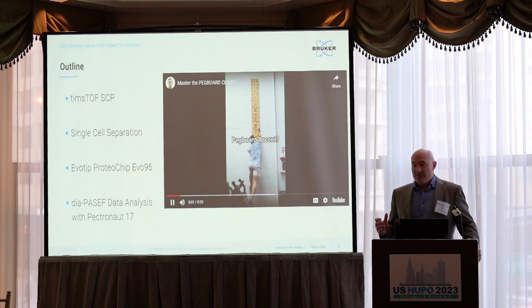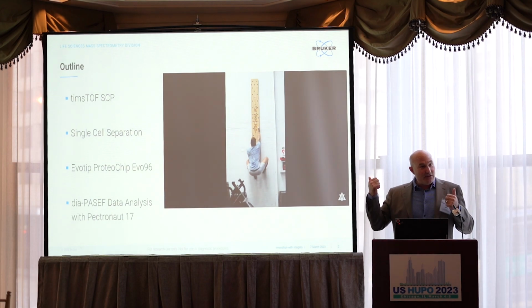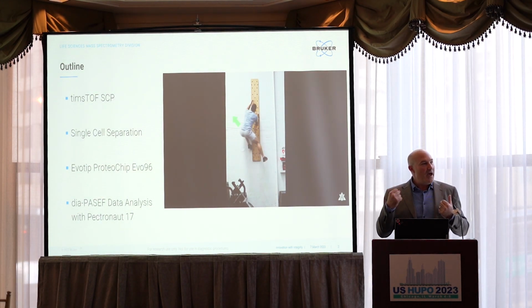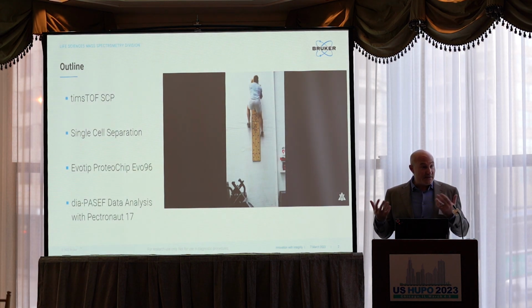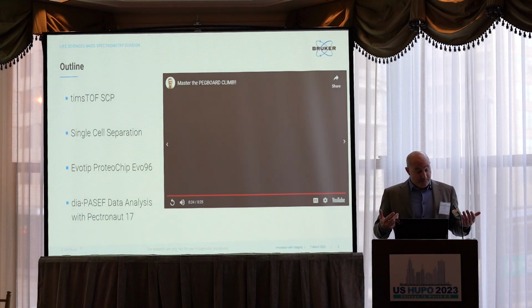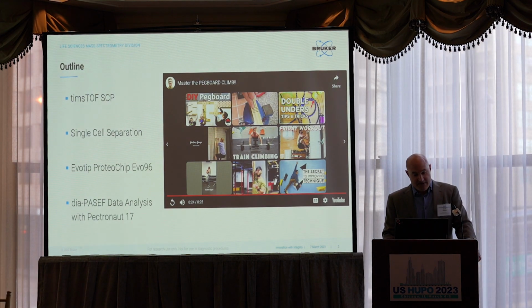Now, I don't know if you guys have ever tried this, probably not, but it's quite difficult. And that guy can do a lot of pull-ups, so that's not the problem. Strength isn't the problem. Sensitivity, the mass spectrometer isn't the problem. But it's all these things coming together, the pegs, the holes of the pegs, and then of course, just the strategy, software itself. So when all these things come together, you can actually get up that thing. And what I will show you guys today is how exactly to do that.